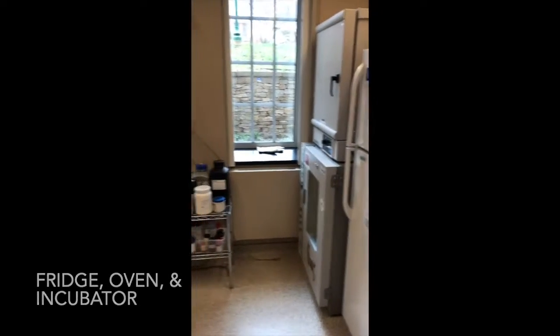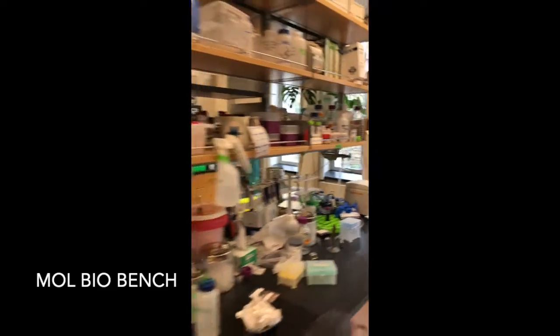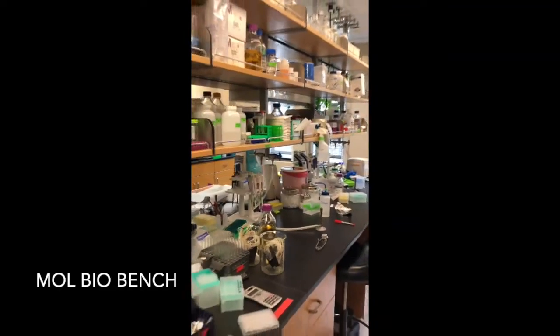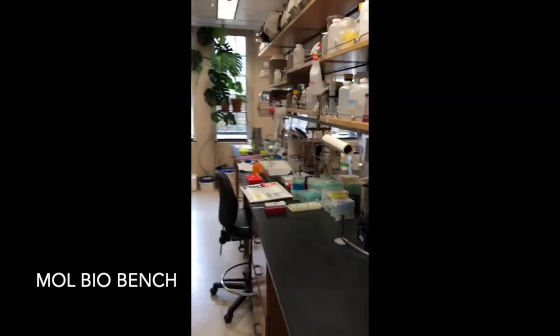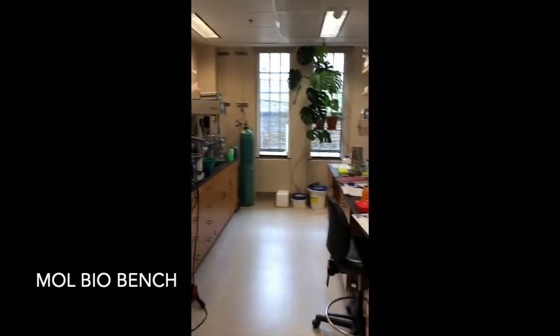Bridges, more incubators, split-leaf philodendron, more molecular biology benches. And on this side another view of that. Also another view of the philodendron.